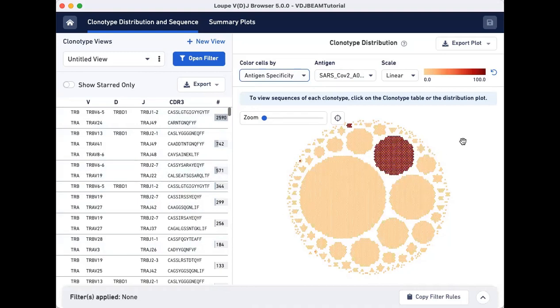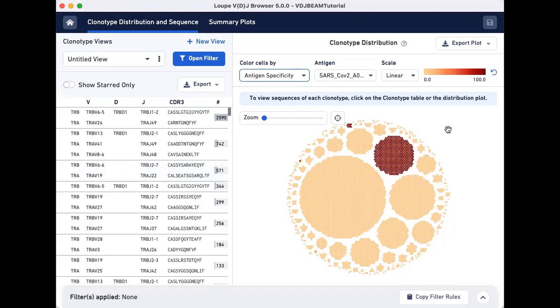In this dataset, clearly there is only one large clonotype that associates strongly with the SARS-CoV-2 antigen.